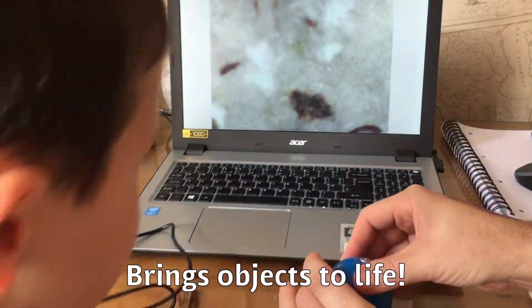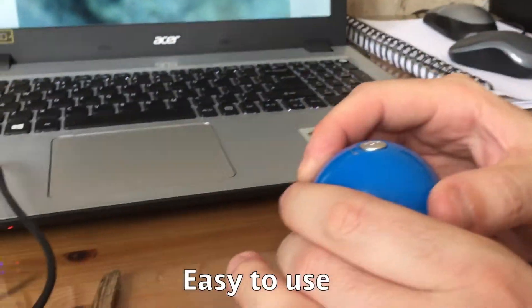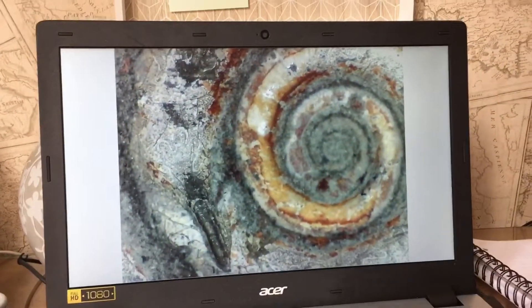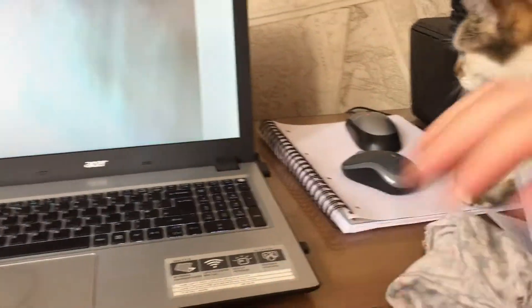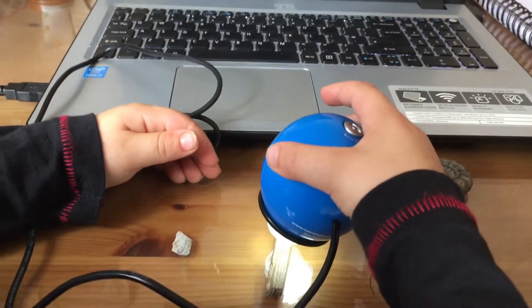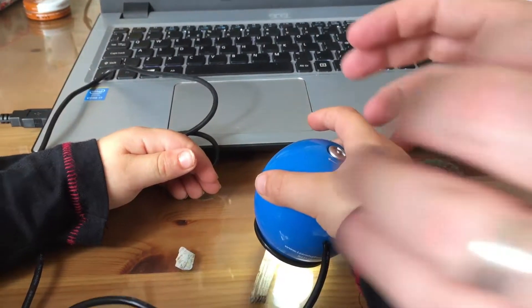What can we see? What are we looking at, dad? We're looking at a shell. We focus here using this dial. That's a fossil Brandon found at another state. Hold it steady and daddy can help with the focus.